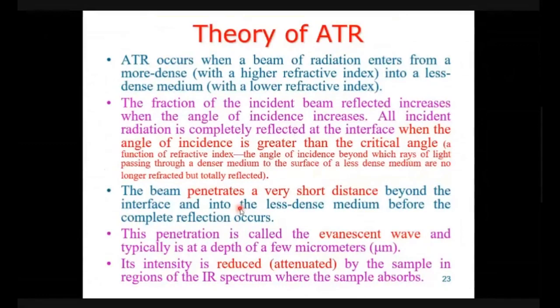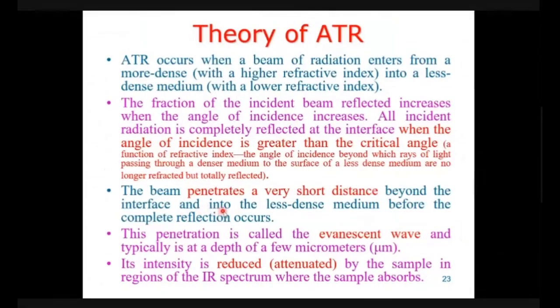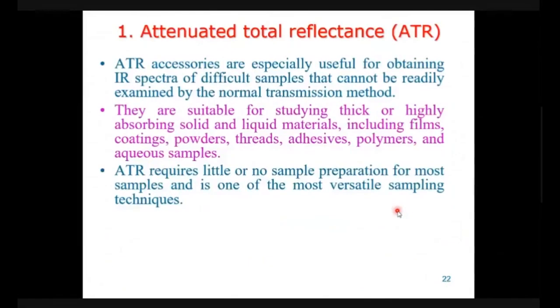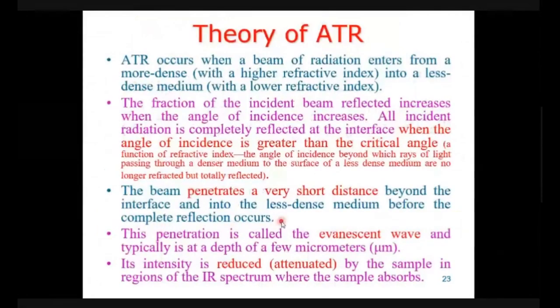So no refraction occurs. The beam penetrates a very short distance beyond the interface and into the less dense medium before complete reflection occurs. Okay, I will read this point again. The beam penetrates a very short distance. See, this is a very short distance penetrated by the wave beyond the interface and into the less dense medium, before complete reflection occurs. And after penetration, it reflects back.